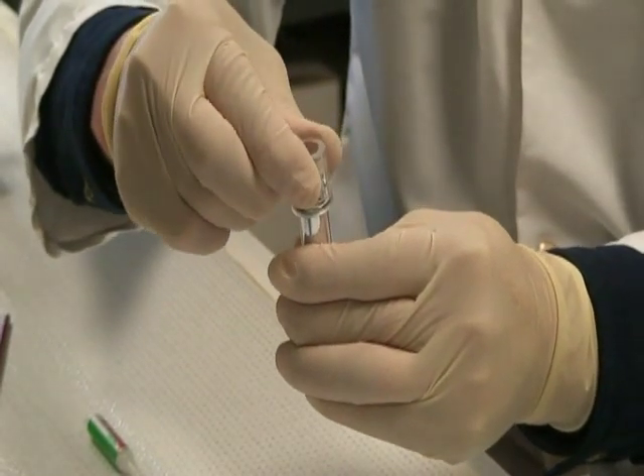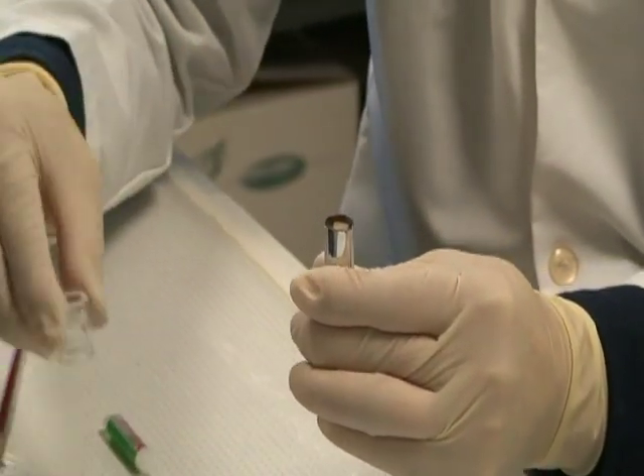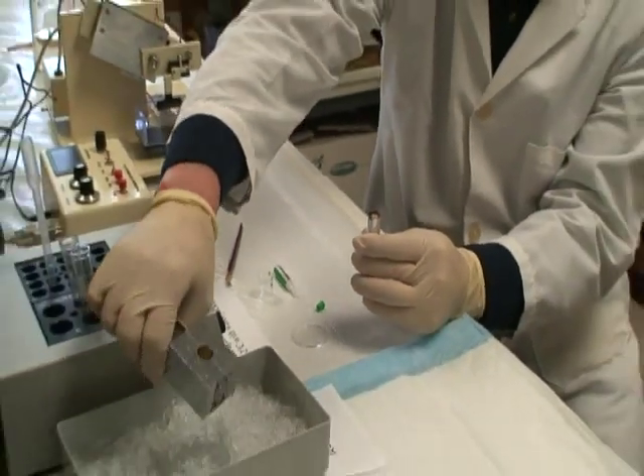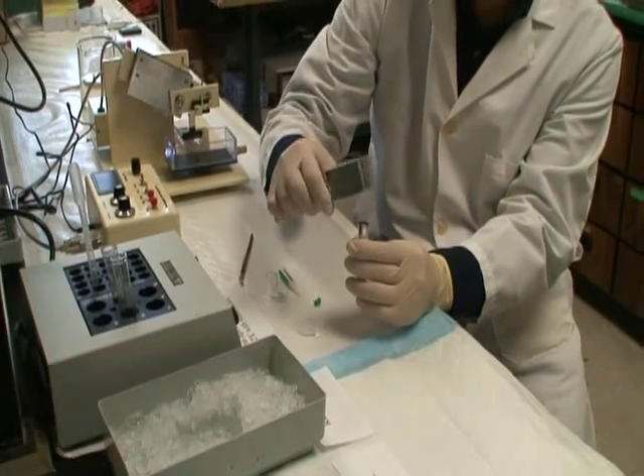Take off the embedding ring. Chill down the agarose for 10 seconds.